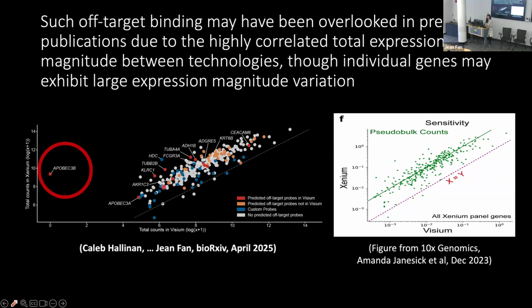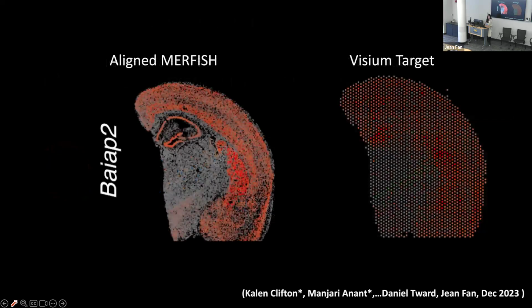Yeah, it's a great question. How do we compare across technologies, considering there might be different normalization differences? When we compare across technologies, like in our STalign paper, we actually did normalize. We can do count CPM-type normalization for the sequencing-based data. We can do volume normalization for the imaging-based data, and just make sure that they are not confounded by different unique artifacts that are in each technology.